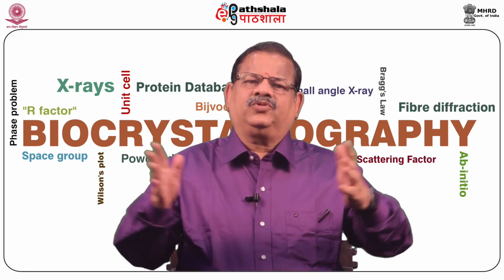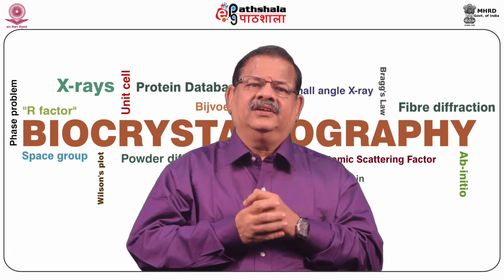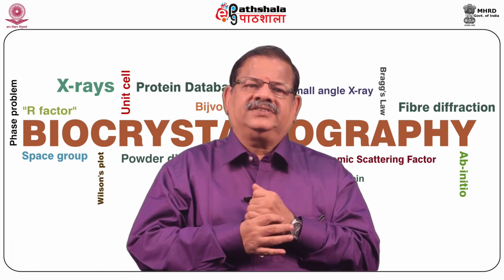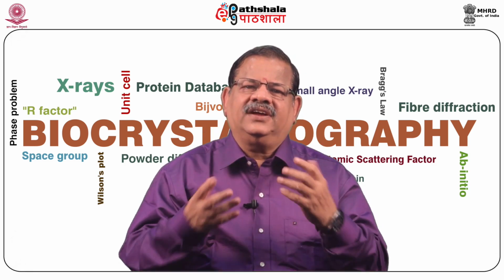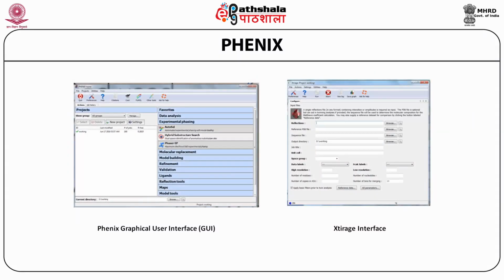PHENIX has a range of tools for the analysis, validation, and manipulation of X-ray diffraction data. PHENIX.xtriage is a comprehensive tool for analyzing X-ray diffraction data. This carries out tests starting from space group determination and detection of twinning to detection of anomalous signal. We have seen what one uses the PHENIX program for. Again, this is a recent version of PHENIX. It's user-friendly. They have developed the graphical user interface called GUI for executing PHENIX. That is shown in this slide.